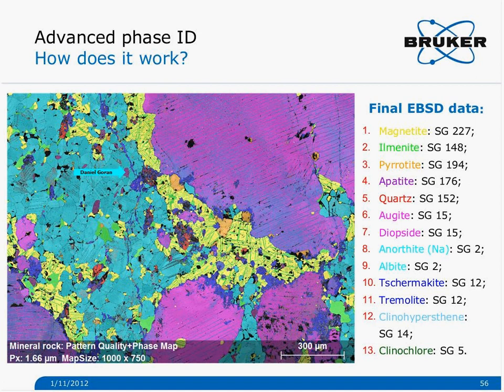So for the moment, the system needs a reaction from the user, especially in these particular cases where the particles or grains we are looking at are so small that they are maybe smaller than the resolution of the EDS technique. Then definitely the user needs to interact and say, okay, that element, I know it comes from the matrix, is not present in this particle or grain.